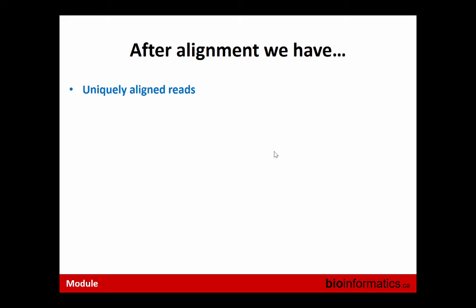You mentioned it is good practice to use the same aligner for multiple data sets. I'm wondering if you ever take the unaligned sequences after doing the BWA and put them into a hash-based alignment to get the most out of your data. Not hash-based, but sometimes I took unaligned reads and used BLAT. BLAT is a heuristic developed by Jim Kent, and you just try to place it. Sometimes you have luck, for example, when you have an indel. As the complexity of modification grows, for example five bases of insertion, aligners start having more difficulties. If this happens in your seed, in the first 32 bases, then it's even harder. The default parameters allow only two mismatches in your seed and no insertions or deletions; all your insertions and deletions have to be in the remaining part of the read.